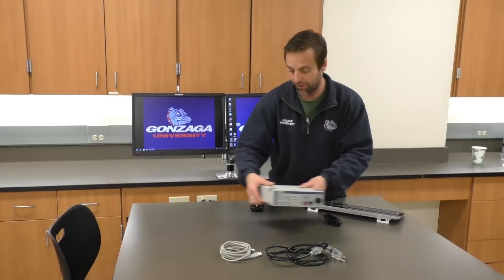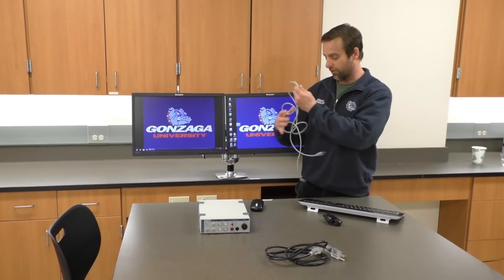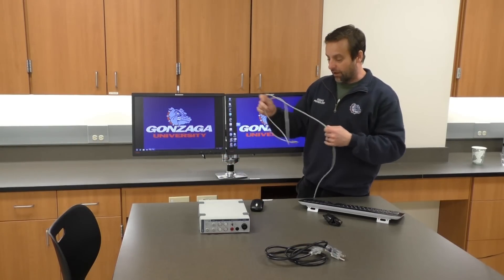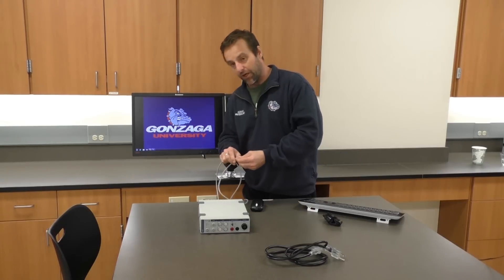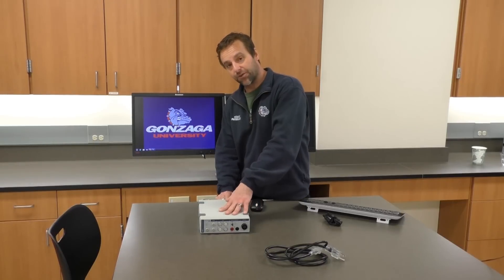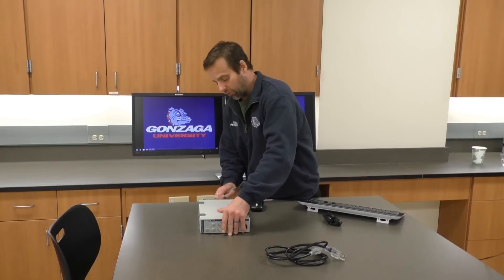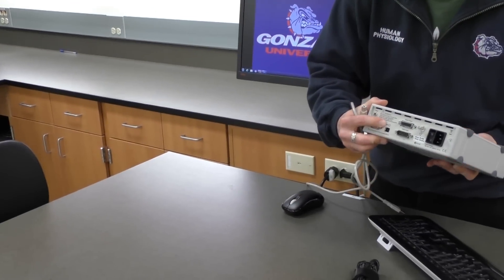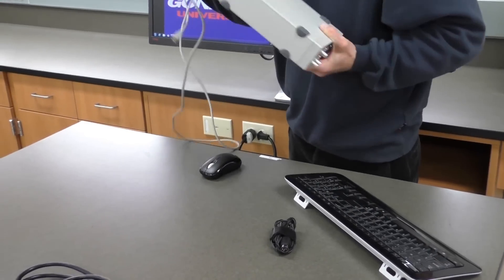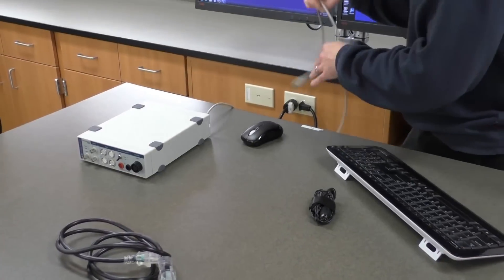Now I have everything I need for the experiment. We're going to use this USB cable. On the front of the computer we have a USB port — this should work most of the time. There are alternate USB ports on the back of the computer if the box isn't communicating with your computer. I'm going to plug this in — there's a little USB icon on the back of the PowerLab box, and I'll plug this end right into there. Everything should fit nicely; don't force it if it doesn't. Then I'll plug the other end into the computer.